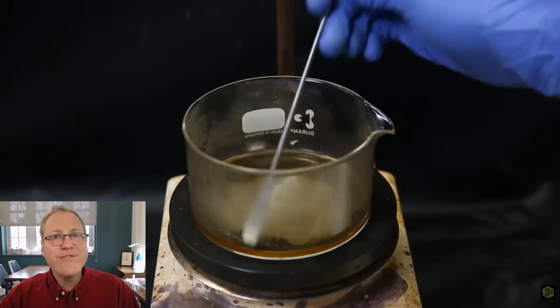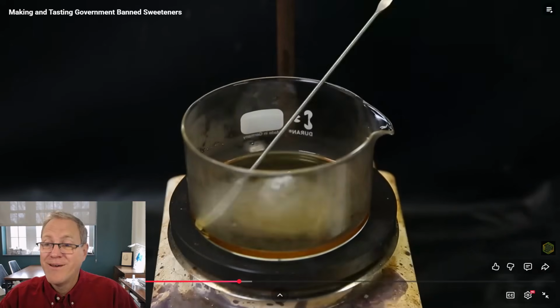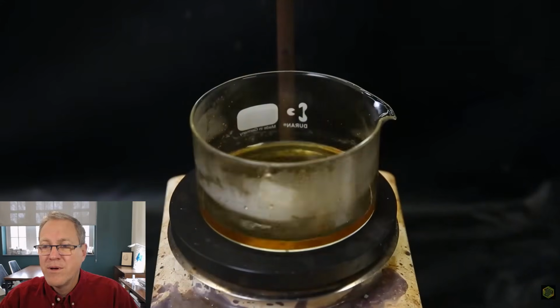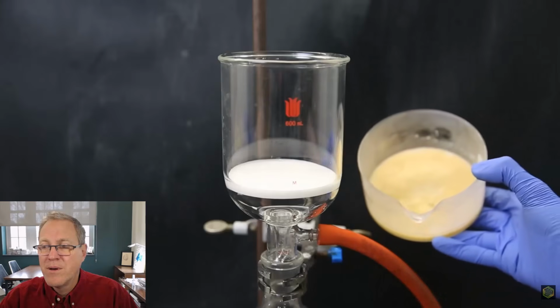He's still got that crazy triangular stir bar in there. That kind of fascinates me. I then add water until it starts precipitating. I then make sure it is all dissolved by adding a bit more ethanol, and then move it to the freezer. It is all crystallized out into this mushy mess.